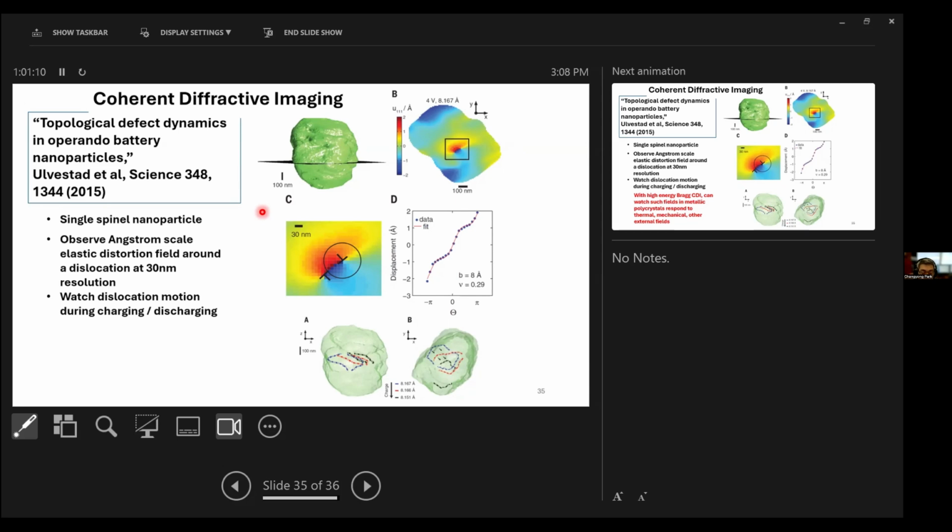So I see. I tried this method myself one time in the past, but it kind of pathetically failed because, exactly as you mentioned, the near field camera's resolution and the size of the field of view of those phosphor screens are really limited to play with enough number of grains, and because it was blocked by the diamond anvil kind of things.